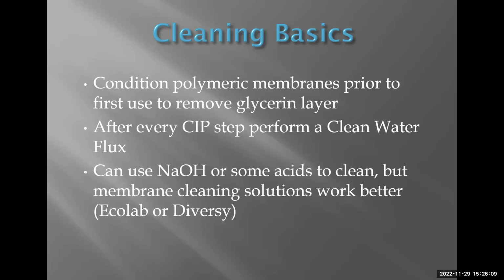It can be 15 to 20 minutes long at 50, 60 C or whatever the membrane might be rated for, and close to the upper limits of its pH range. After a very quick CIP, you do a clean water flush, and then a clean water flux on the machine to verify what your membrane's flux rate actually is in its cleanest situation. You'd record all the parameters: the flow rates, the permeate flow, the retentate cross flow, the temperature, and the pressures.